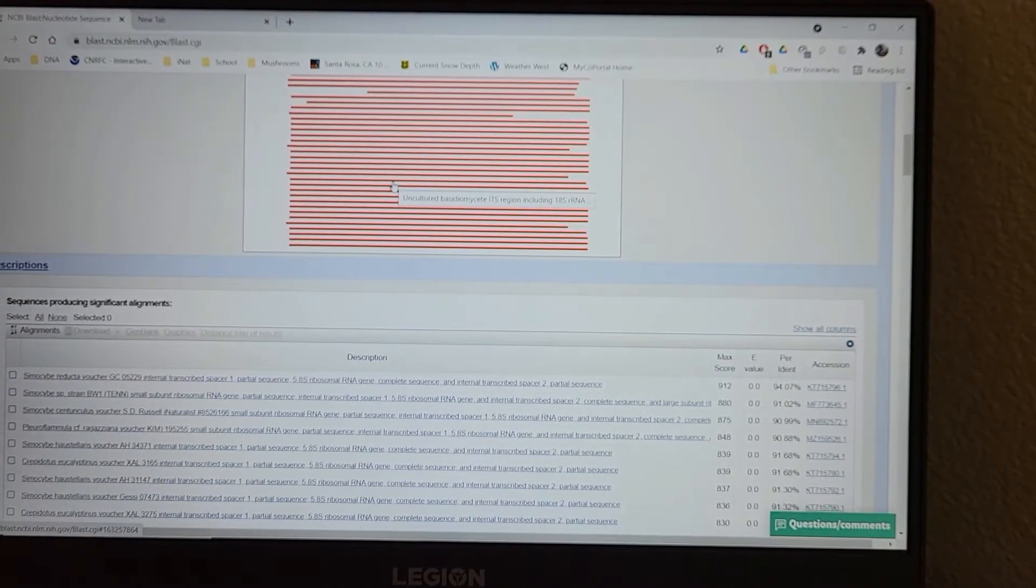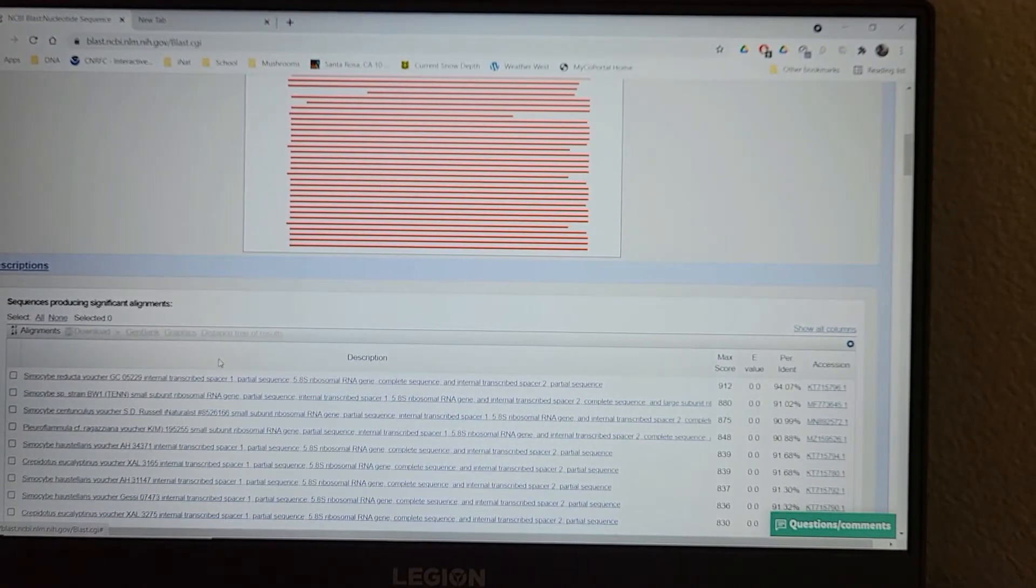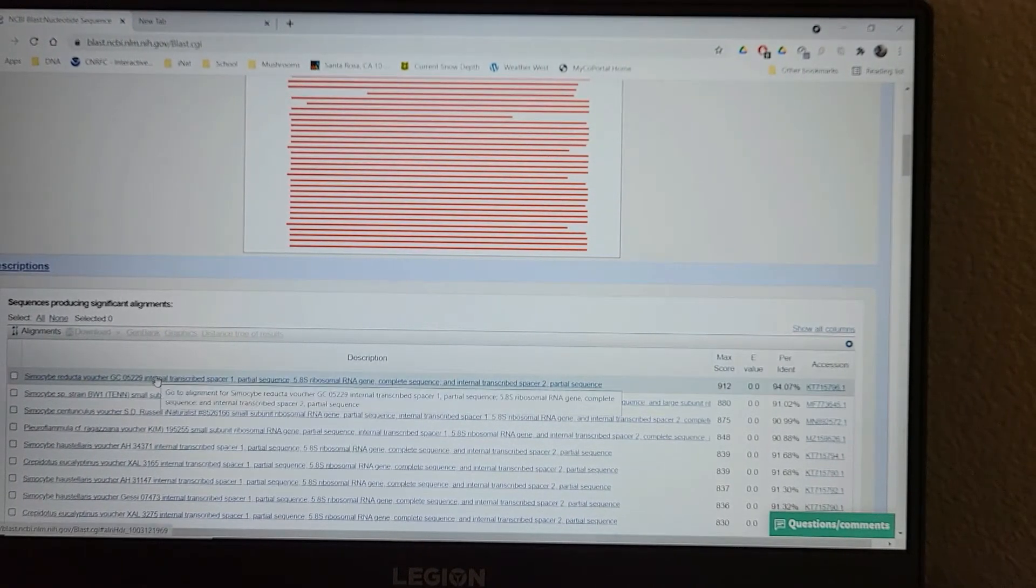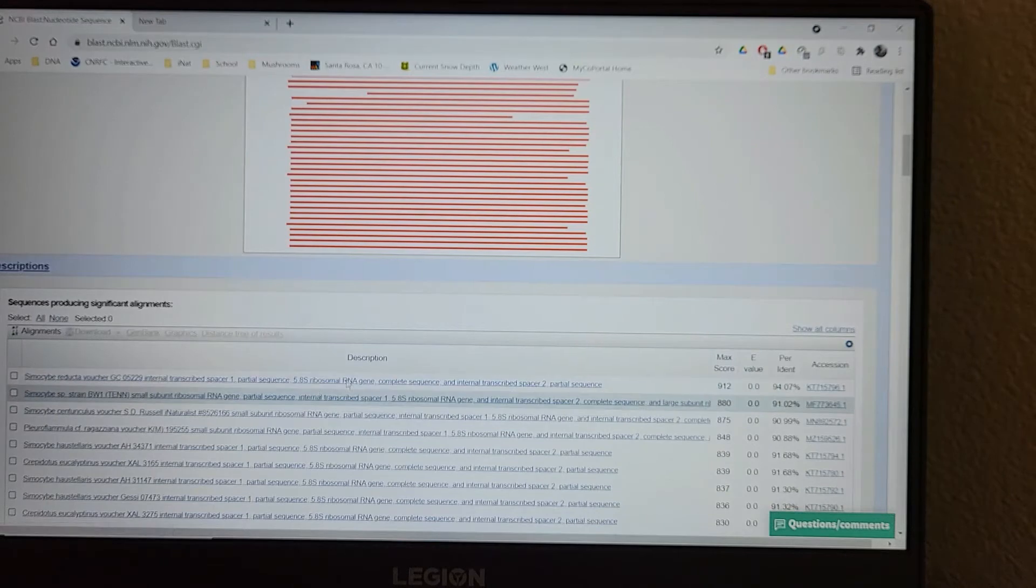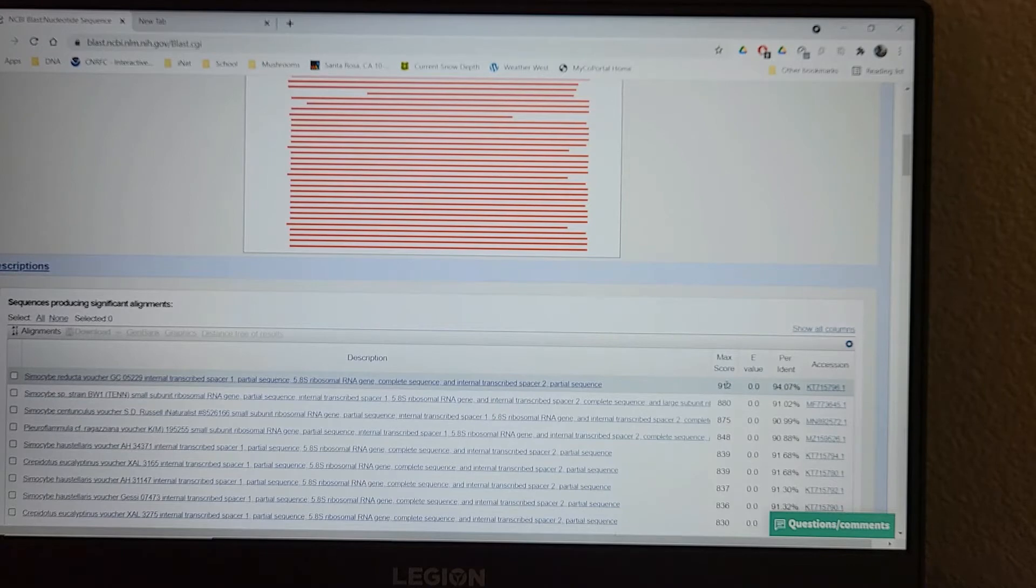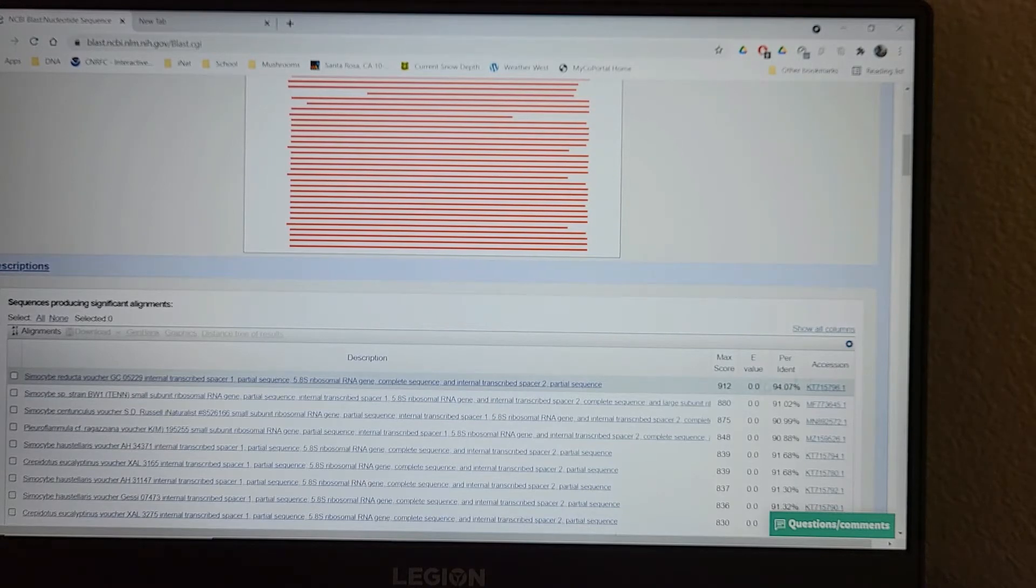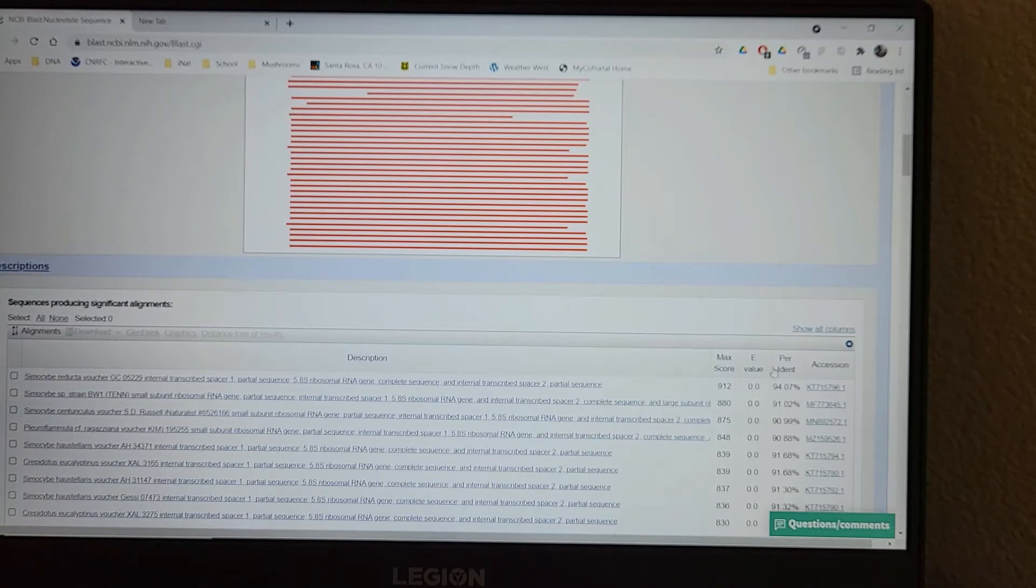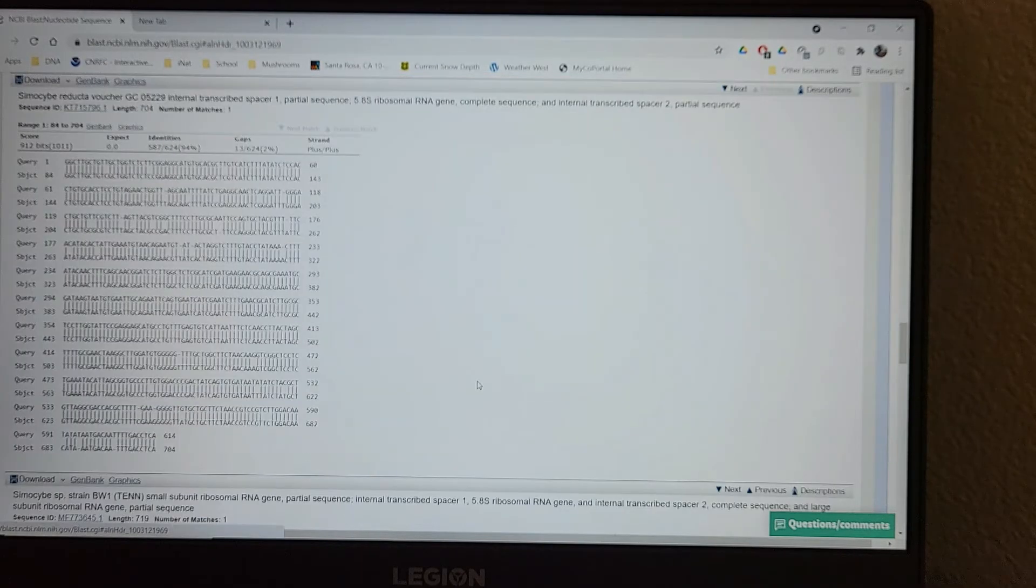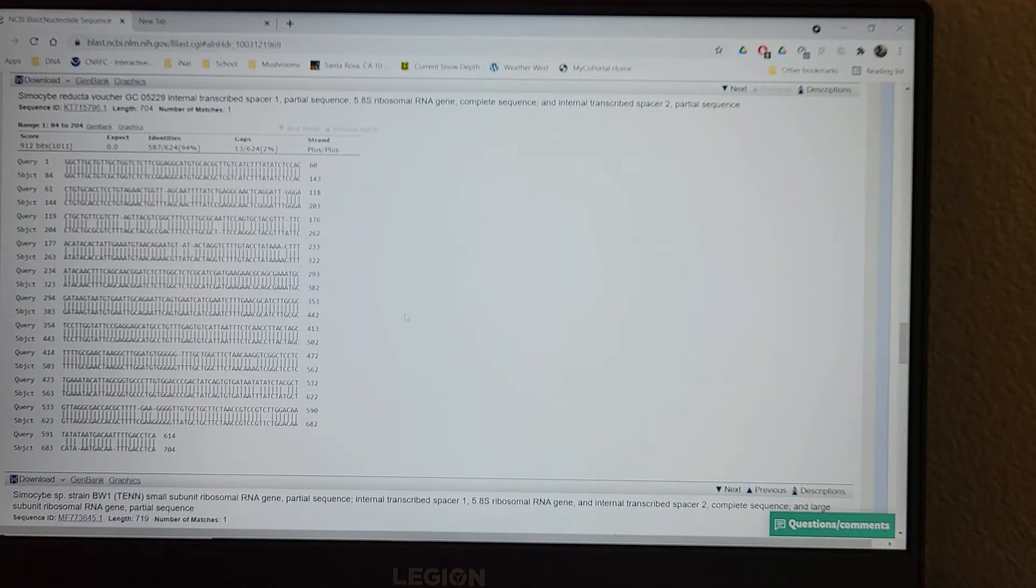Our top hit, Saimosabe reducta. It's got a max score of 912. That's based on a bunch of different characteristics. Really what I'm looking for is the percent identity. So I'm going to go ahead and click on that sequence. That's going to bring me to the pairwise alignment.